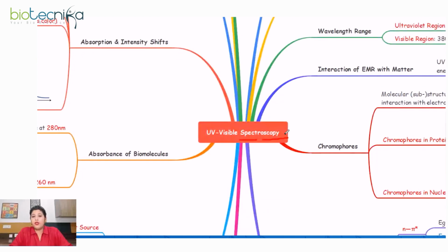So in spectroscopy, basically we study what happens when radiations like ultraviolet, visible radiation, infrared, microwave, X-ray, interact with matter, that is, something which has mass and occupies space.